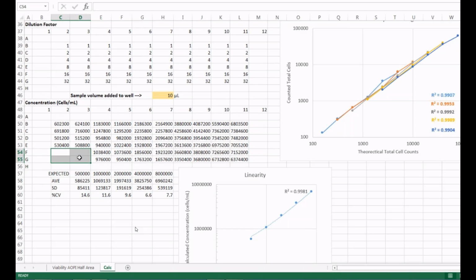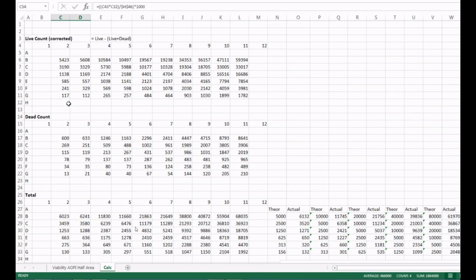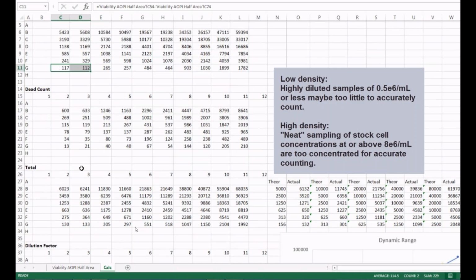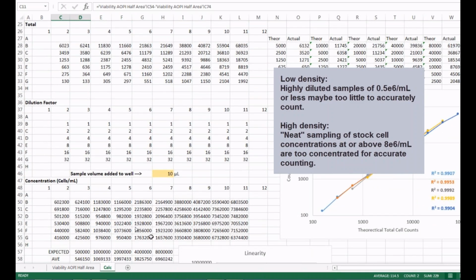So this is basically an exercise to help you understand when you have so many unknown samples. This one helps you understand the dynamic range of what confidence you can have in the cell counting for the plate-based assays. So at this low density, you might want to eliminate samples that come out with 100 cells per well, because you just may not have the highest accuracy when you have diluted it out that far on the low samples.